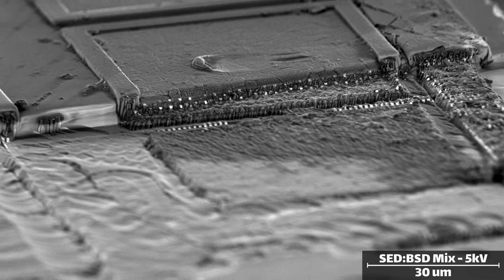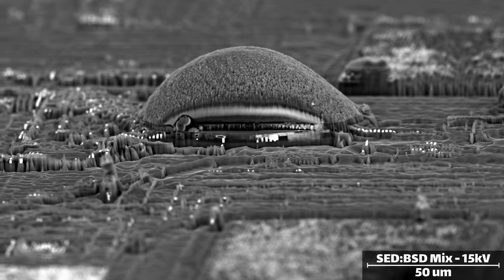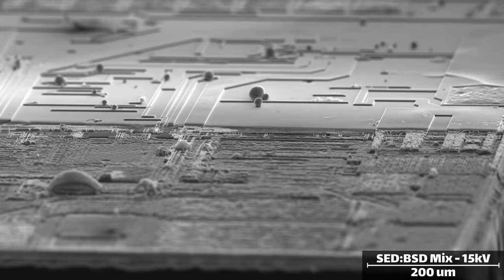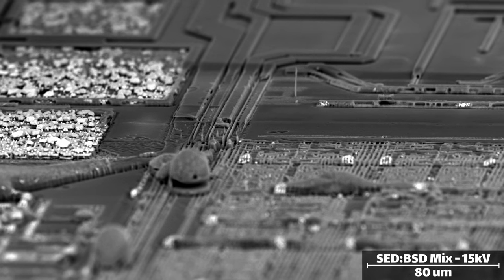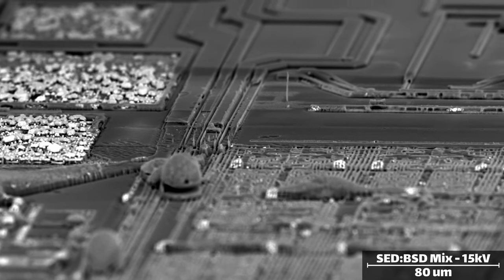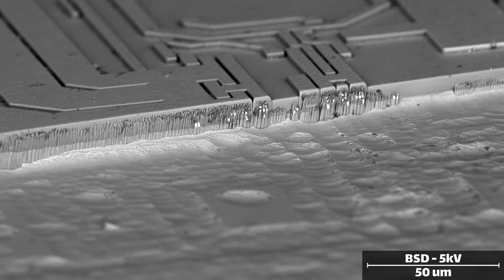In some places there's a large blob of material, and this is actually aluminum that melted and then balled up. The ion etching process can generate an extraordinary amount of heat, simply from the argon impacting the sample. It's a lot of kinetic energy that is being dissipated into the sample, and because it's in vacuum, there's no air to help draw the heat away. If you're not careful, you can get samples up to a glowing red heat, which in this case was enough to melt the aluminum.